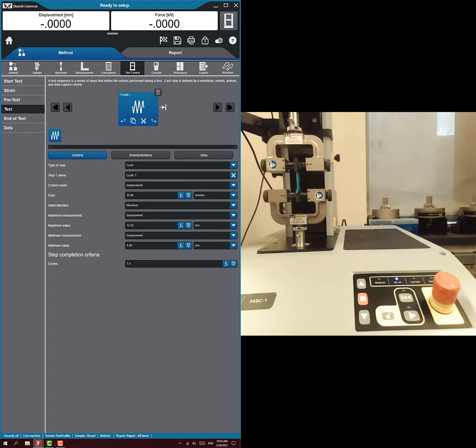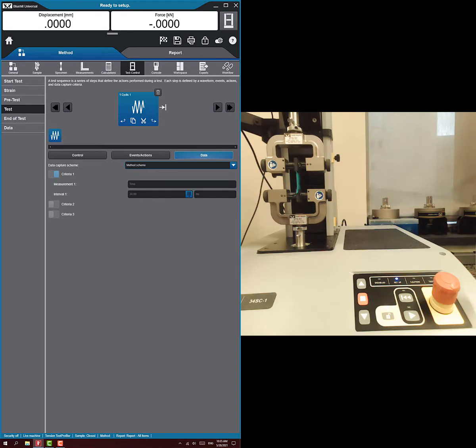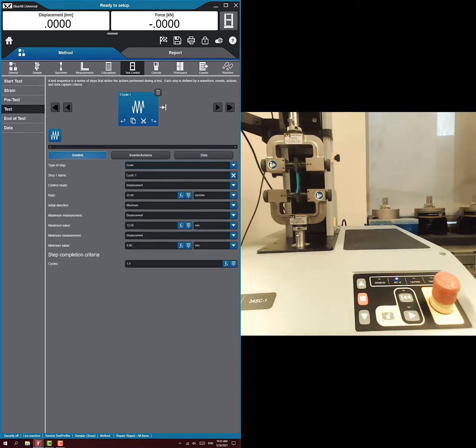There's not much else to mess with here — that's what we want to do, run one cycle. You can make really complex sequences and add more steps after this one, but that's all we need. We set one waveform to do hysteresis.